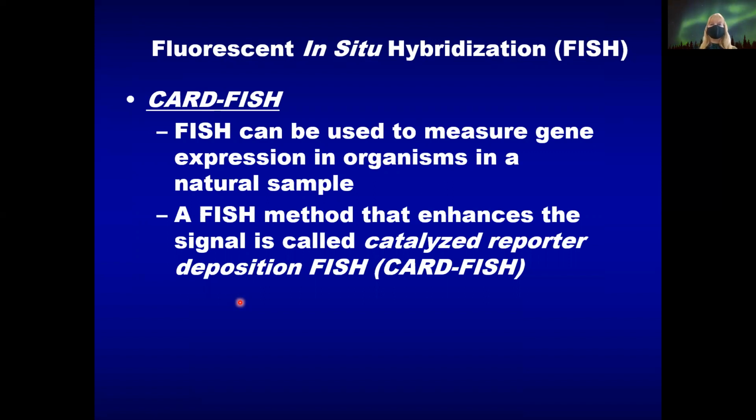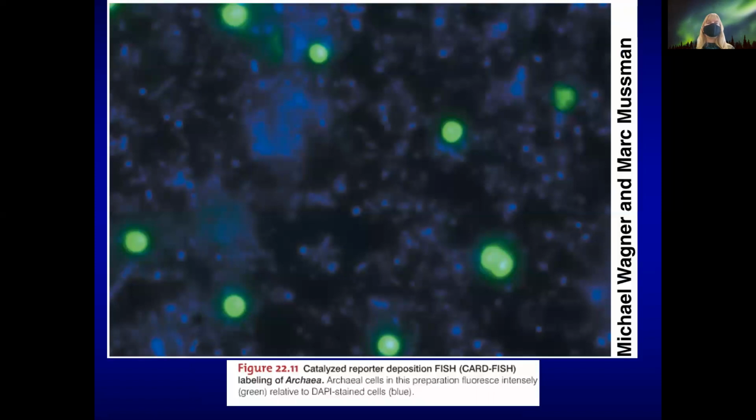And that's what you want. You want to see that they actually have those genes turned on and are actually active. So the CARDFISH technique is sensitive to that. And again, it's a great way to ask questions about what is actually happening. What are they doing in the environment, not just whether or not they're present or absent.